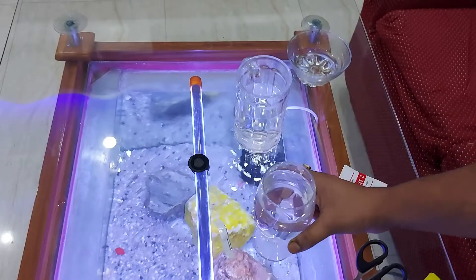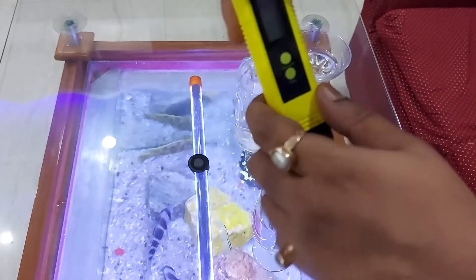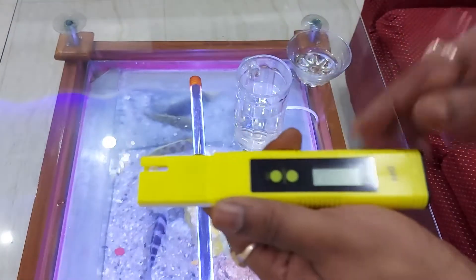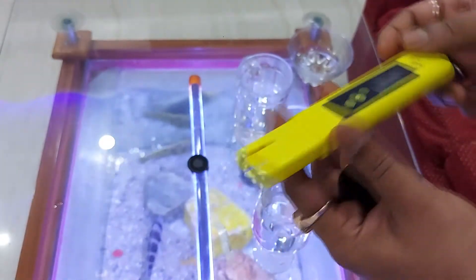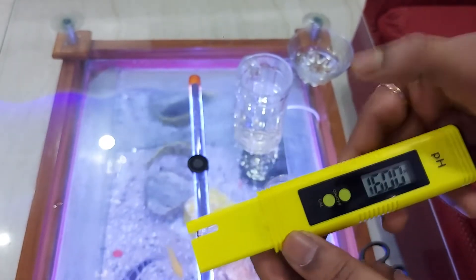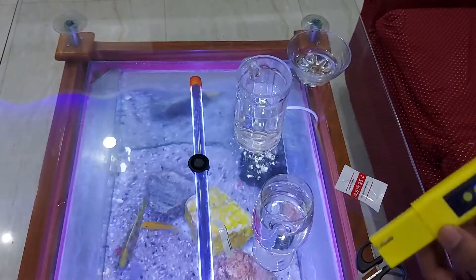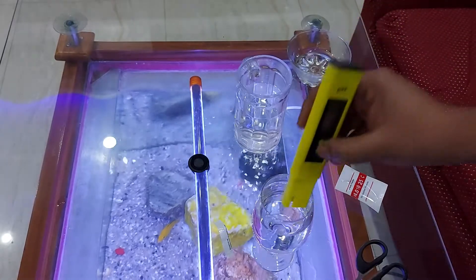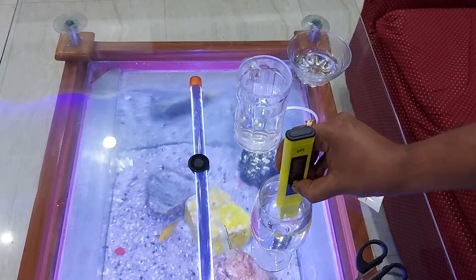Now we will take the pH meter and remove the cover. You can see the on/off button and the calibration button. First you have to turn the pH meter on, then dip it inside till the marked level — it does not have to cross that level. Dip it inside and press the CAL button for five seconds, keep pressing.